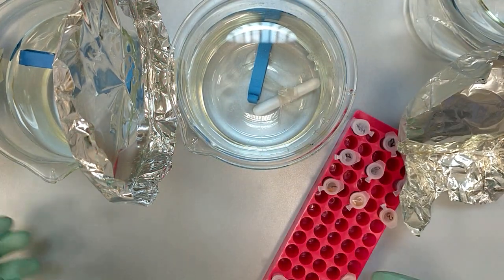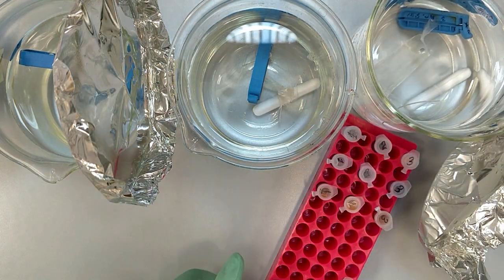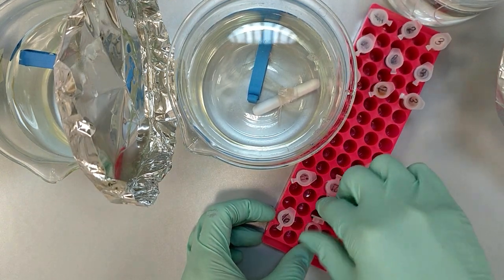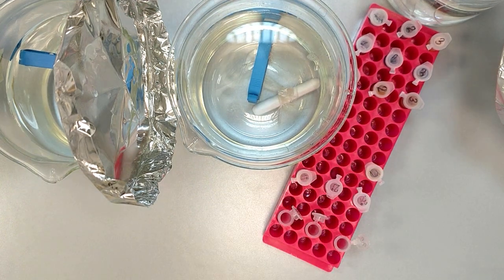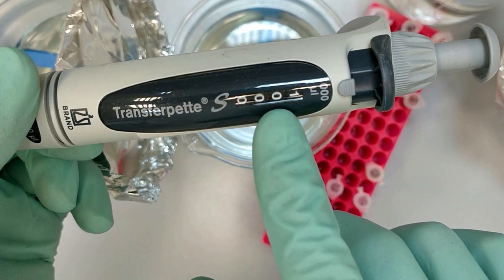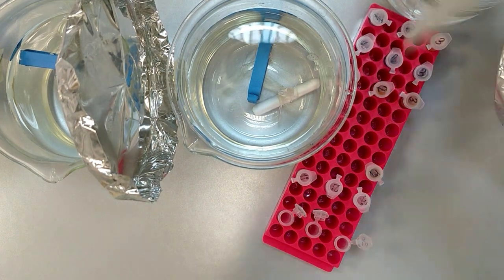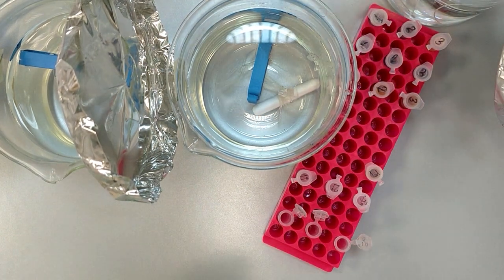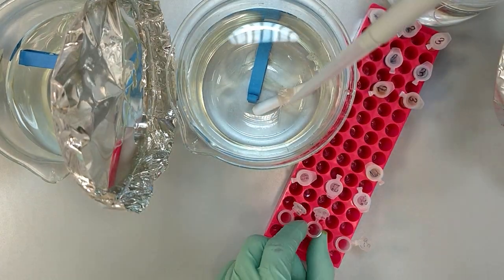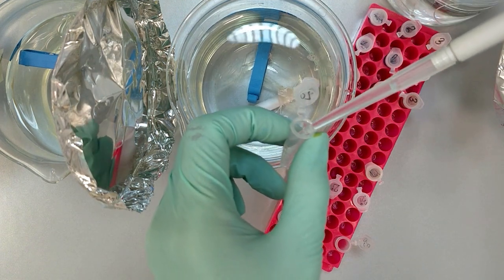So first, because it's much easier to collect, we're going to collect the outsides of each of the membranes. To do so, we are going to open the outside row, then take a 1 milliliter pipette. So you can see it here, 1 milliliter, and transfer the outside of each of the beakers. So here we have the second one, so we transfer it to the 2O Eppendorf.